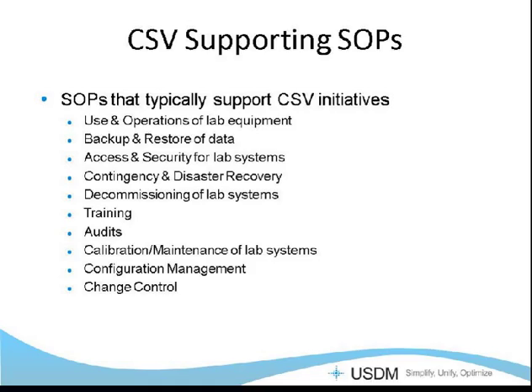Decommissioning lab systems. As we start moving out our legacy systems, we want to go ahead and do something with that data. The data that was generated needs to be able to be recoverable for as long as the regulations say or as long as you need it. And so how do we go back and take a system out of use and still be able to access that data? So we need to put plans in place to do that, whether we PDF that data, whether we print it into hard copy, whether we migrate it into a new system through an upgrade.